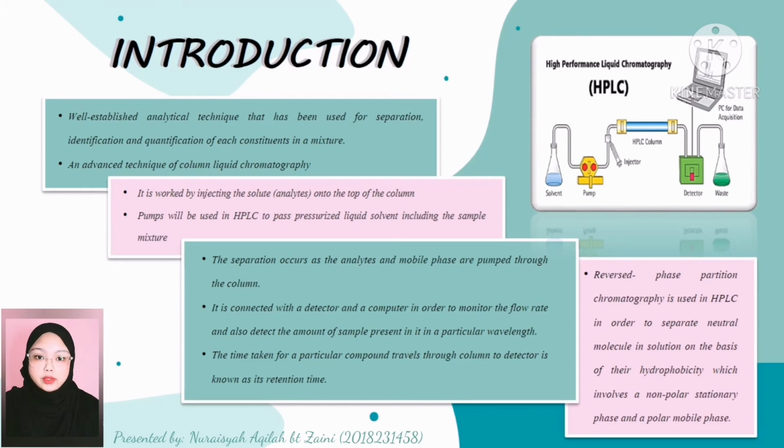Pumps are used to pressurize the liquid solvent, including the sample mixture, allowing it to enter a column filled with solid adsorbent materials at high pressure. The separation occurs when the analyte and mobile phase are pumped through the column, which has tiny particles of only 15 micrometer diameter, allowing a large surface area for the molecules to adsorb, which is called the stationary phase.